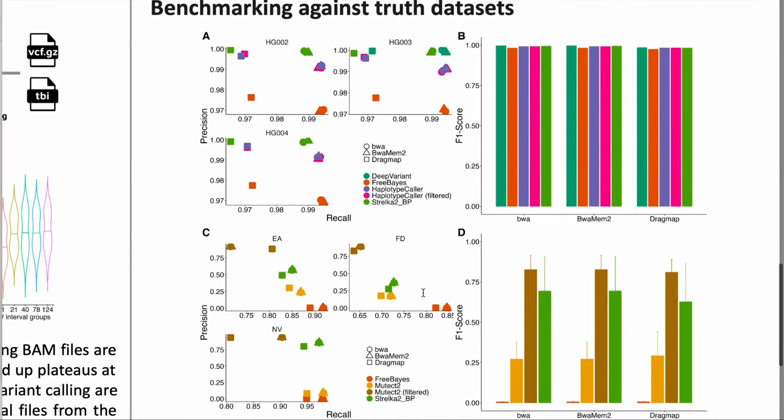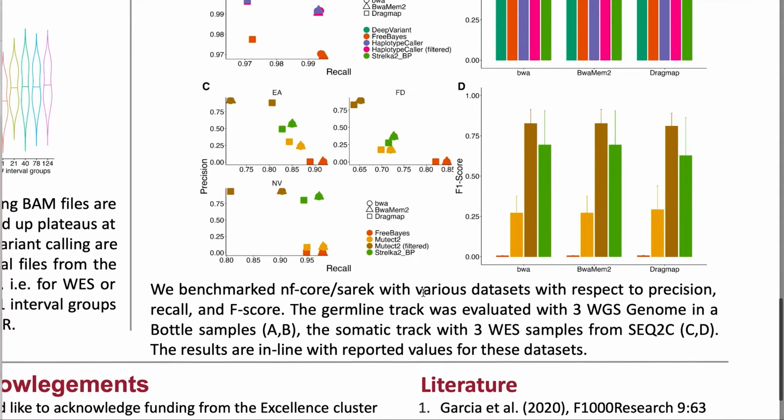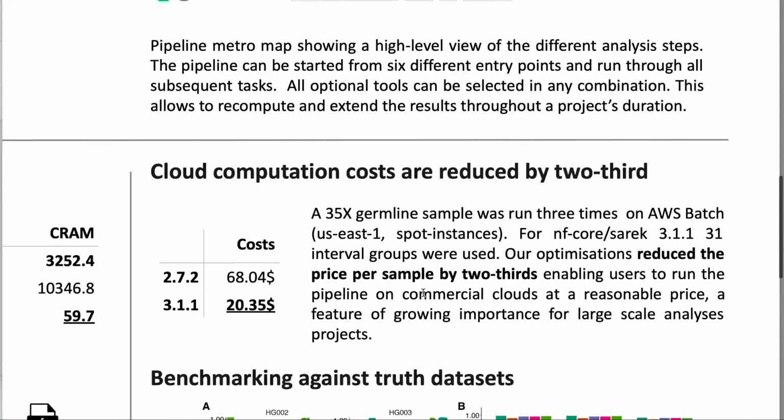We also benchmarked against common truth datasets such as Genome in a Bottle or from the SEQC2 consortium, with results as expected.